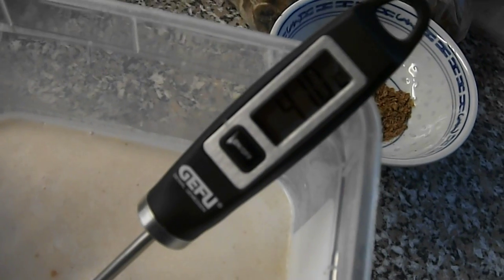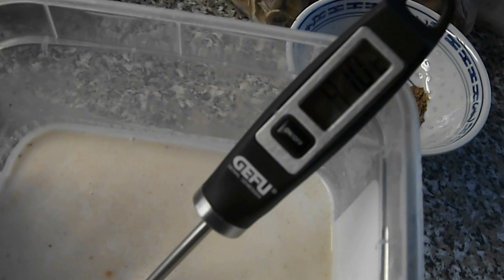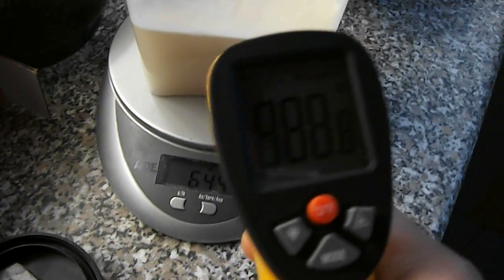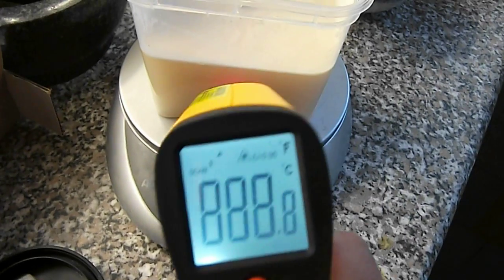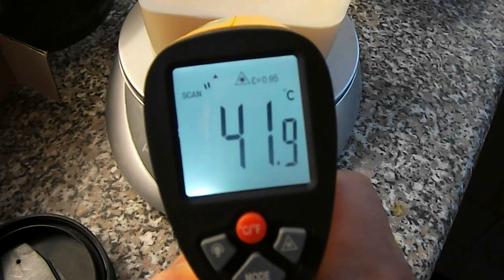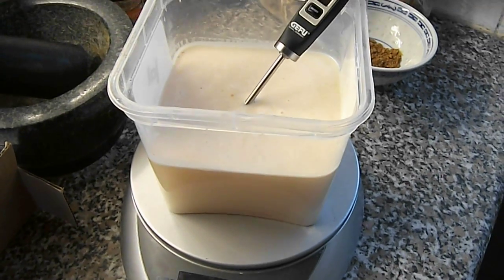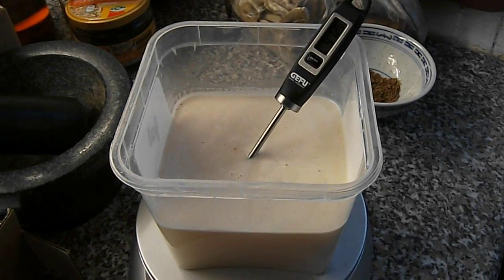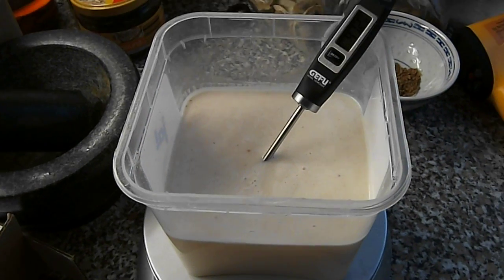The liquid temperature is 41 degrees Celsius inside, and the outer temperature of the box is 41.9 degrees Celsius. Today is June 1st, 2011, and we will see after 24 hours what the development of this liquid is.